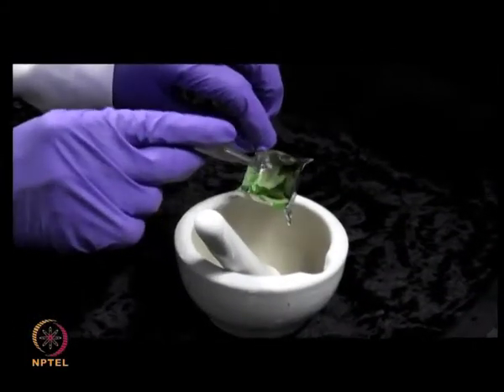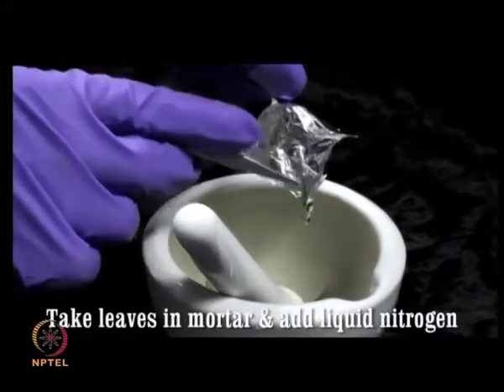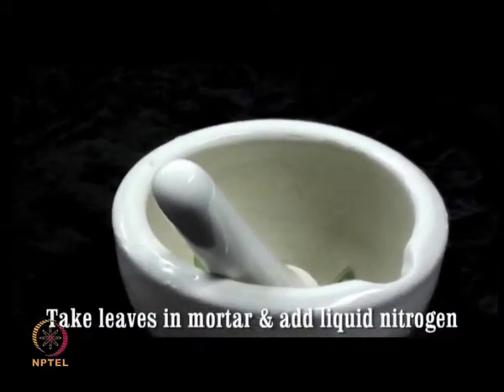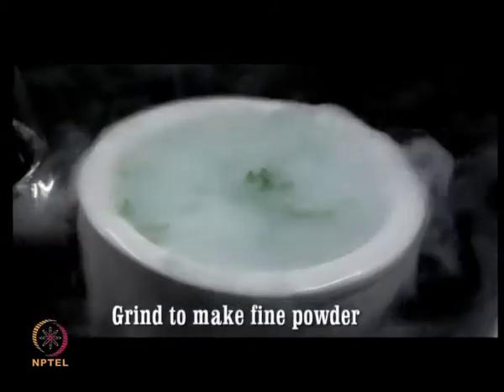Transfer these leaves to a chilled mortar and carefully add liquid nitrogen to it, which helps in drying up the leaves instantaneously. Grind the leaves well using a pestle to obtain a fine powder.